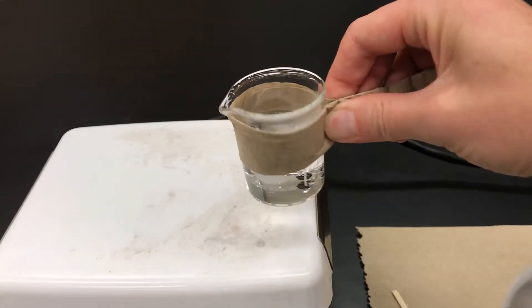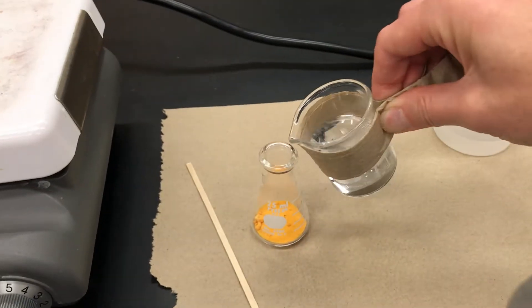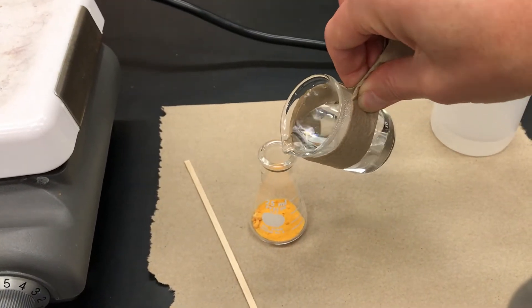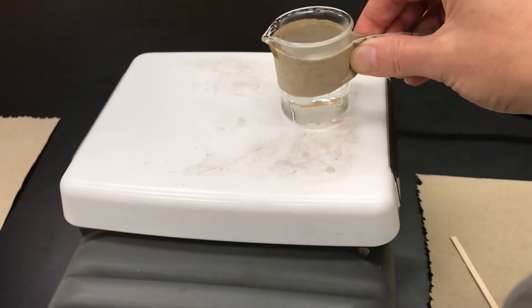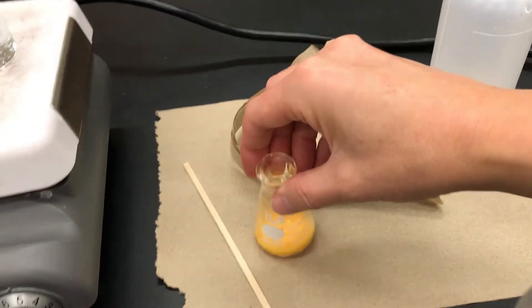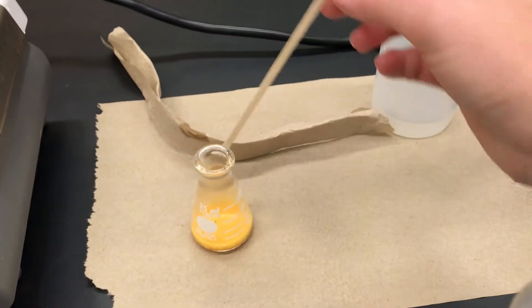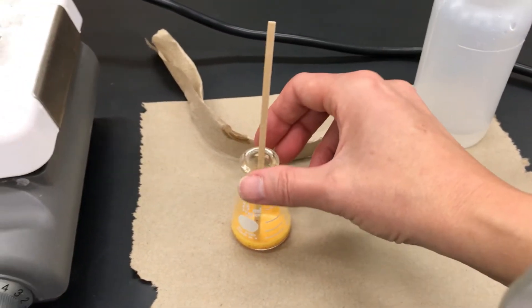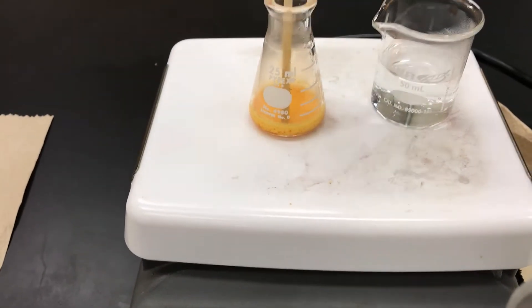I'm going to take that hot water and pour a portion of it into my impure solid, then return the water back to the hot plate to keep it hot. I'll put the flask on the hot plate, and since I'm doing the crystallization inside that flask, I'm going to use a boiling stick or wood splint instead of boiling chips because it can easily be removed later.